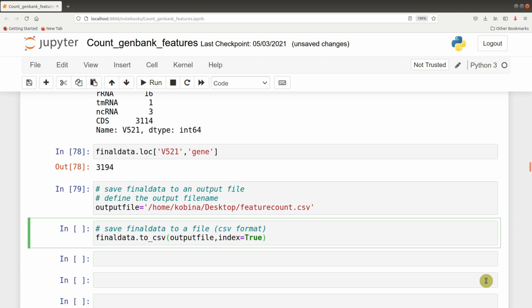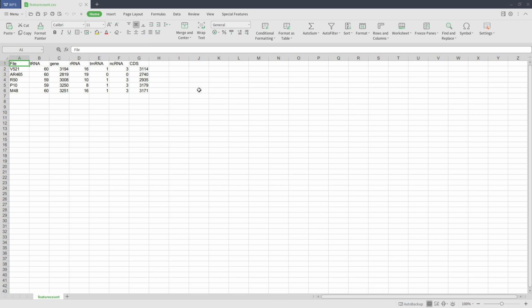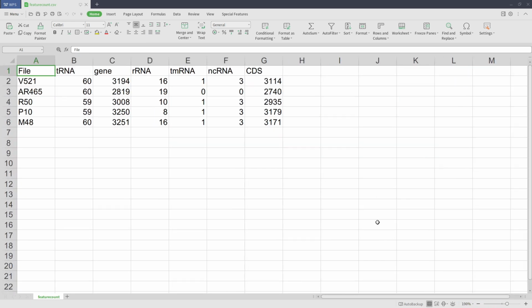So we save it. Now it has been saved to the desktop. So let's go and check it out. So this is the file output. So let's open it. Good. So now we have it here, nicely done for us.